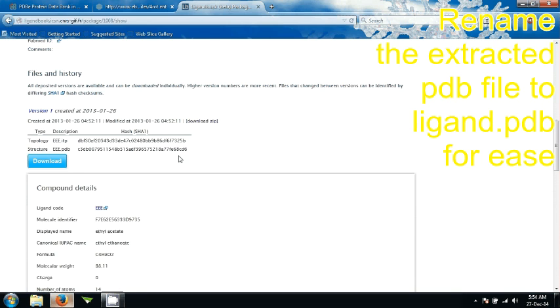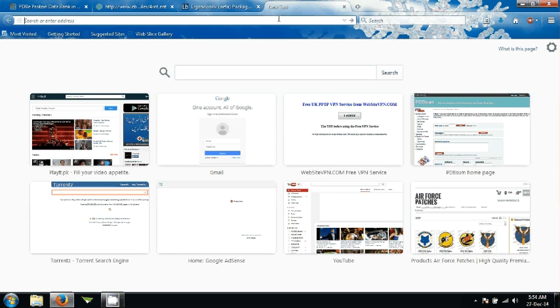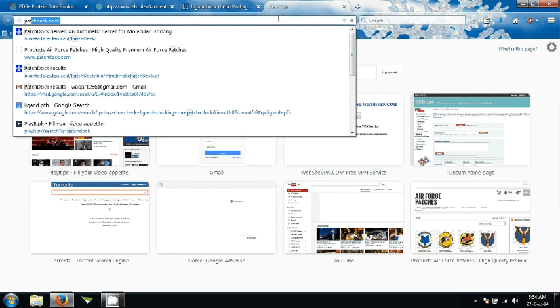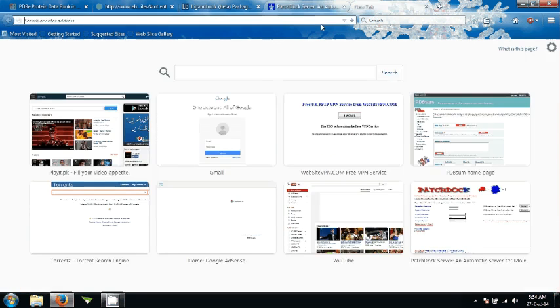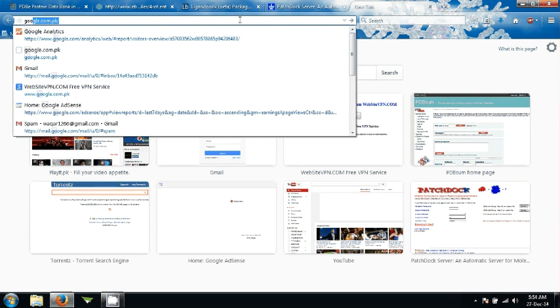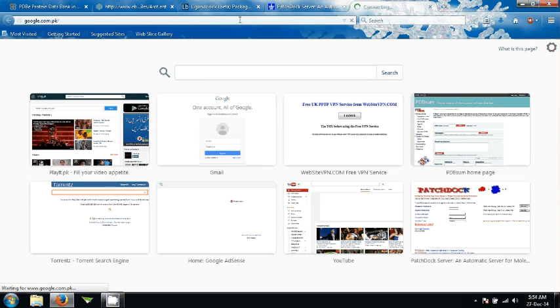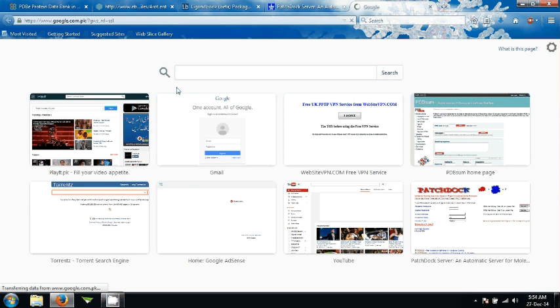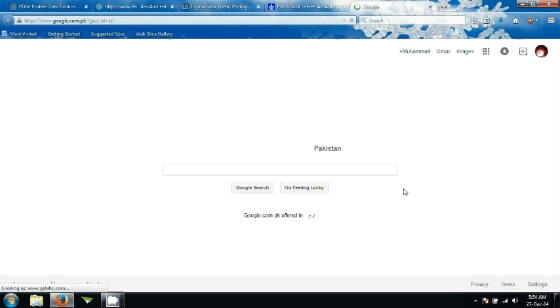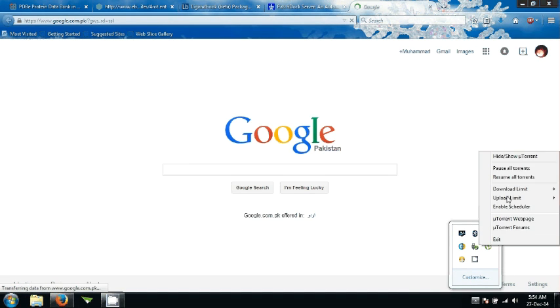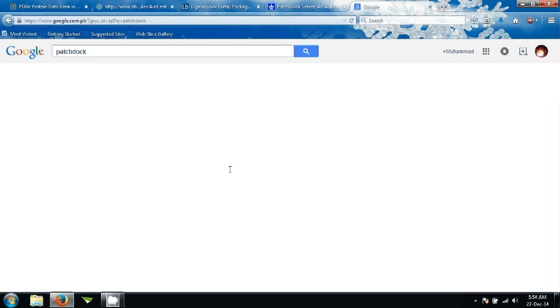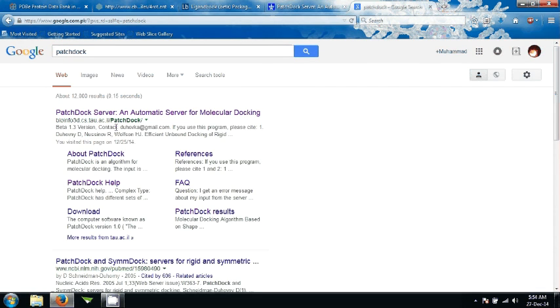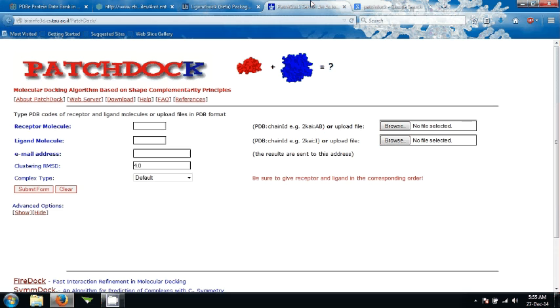Next thing that you need to do is you need to go to PatchDock. In order to do that just google PatchDock. Type in PatchDock. The first one will show bioinfo3d.cs. Go ahead. I have got this page.